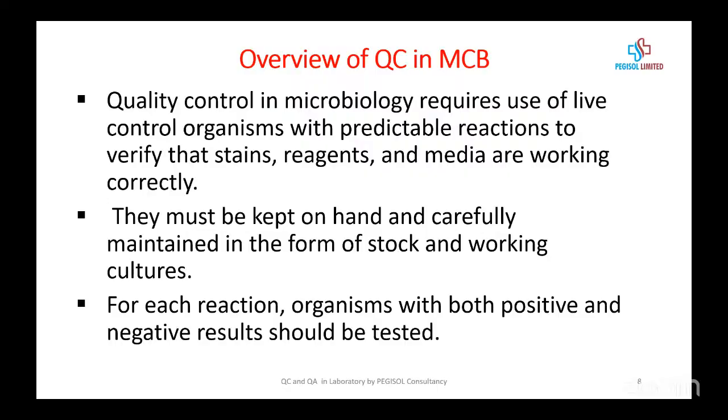Quality control in microbiology requires the use of live control organisms with predictable reactions to verify that the stain, the reagent, and the media are working correctly. So they must be kept on hand and carefully maintained in the form of stock. We have stock culture and working culture. For each reaction, organisms with both positive and negative results should be tested.